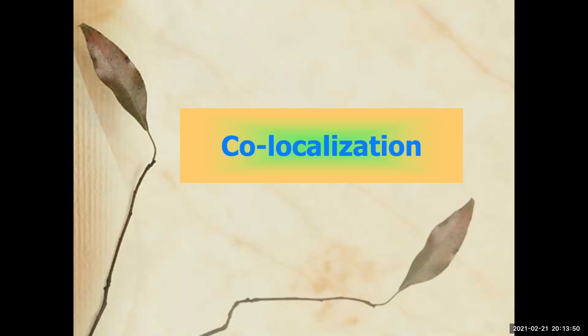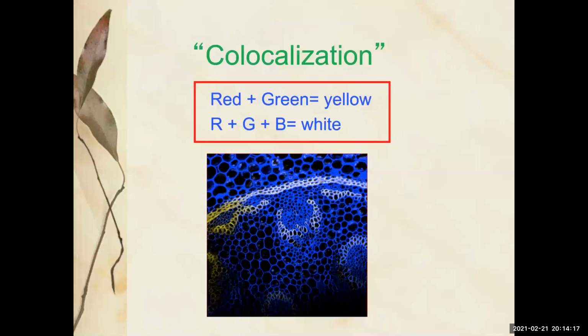In your cell, proteins really do things by interacting with each other. So there's a lot of metabolism that's about, is it near enough? Is it open for business, so to speak? Are things next to each other? I feel like we're learning that as humans now with the viral spread. One thing that happens when we're all moving around next to each other is viruses can spread. In cells, everything's moving around, and proteins, everything's moving, basically. We're seeing that with fluorescence microscopy, except what doesn't move are cell walls, which is an image.